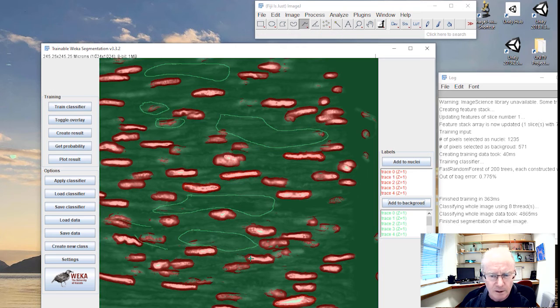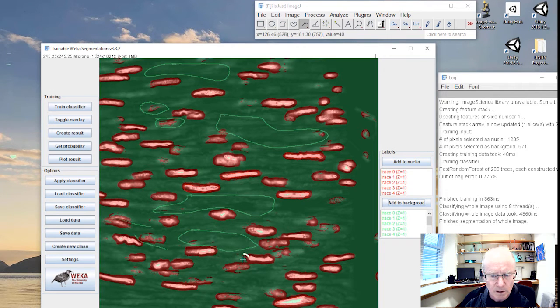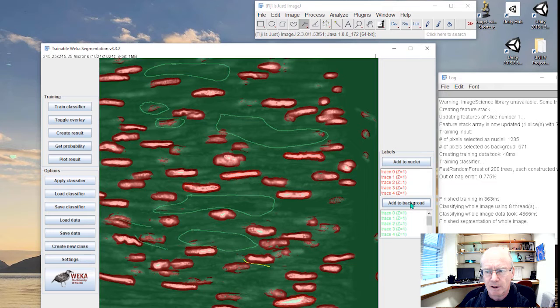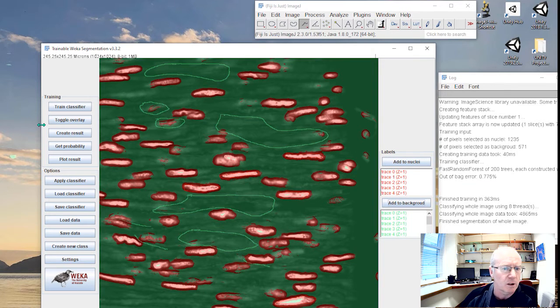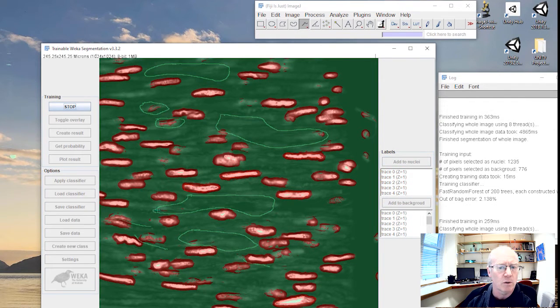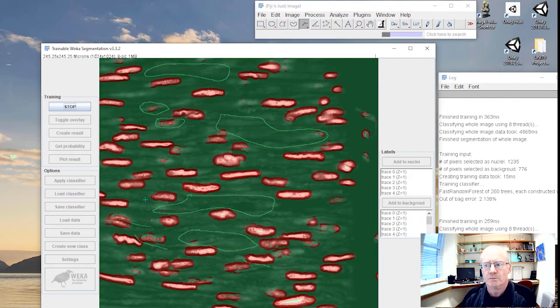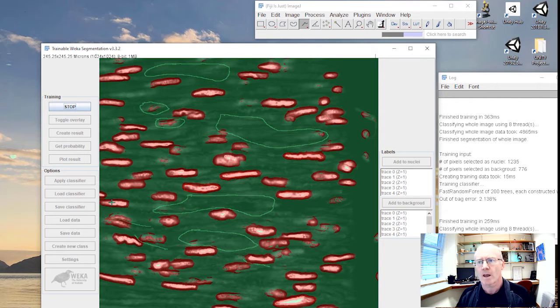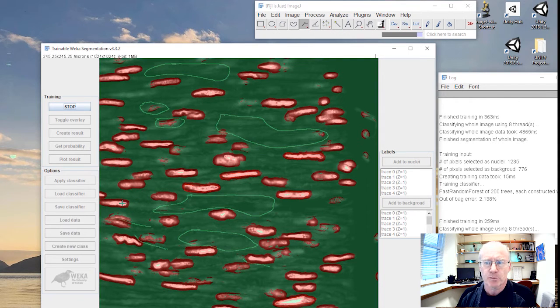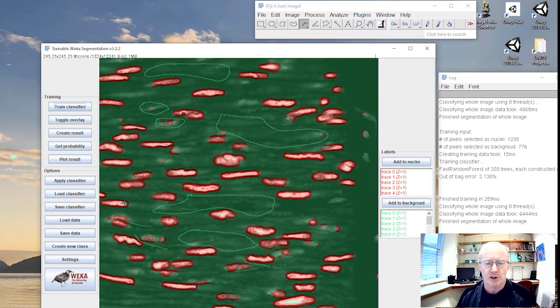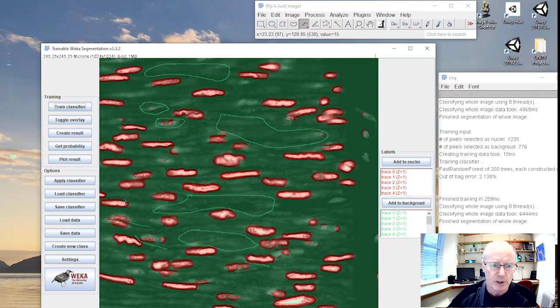Let me train this again, see how we go. And you would just go through this iterative process until such time as you are happy with the result.